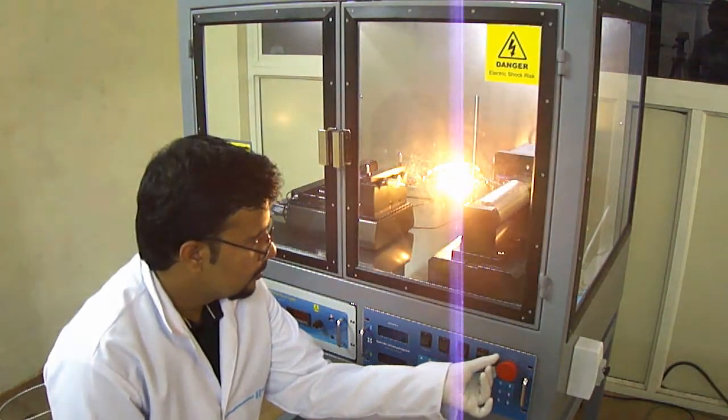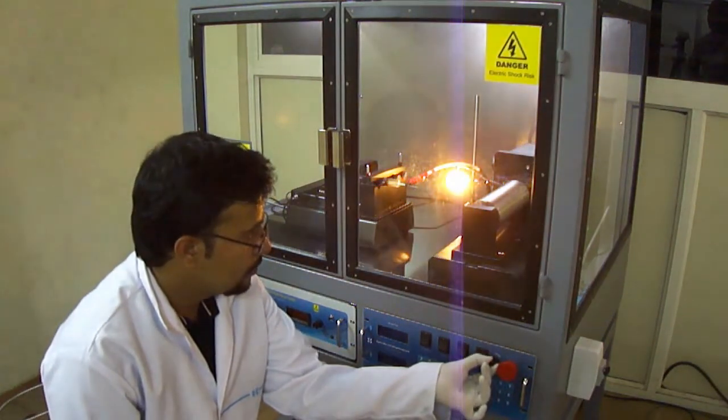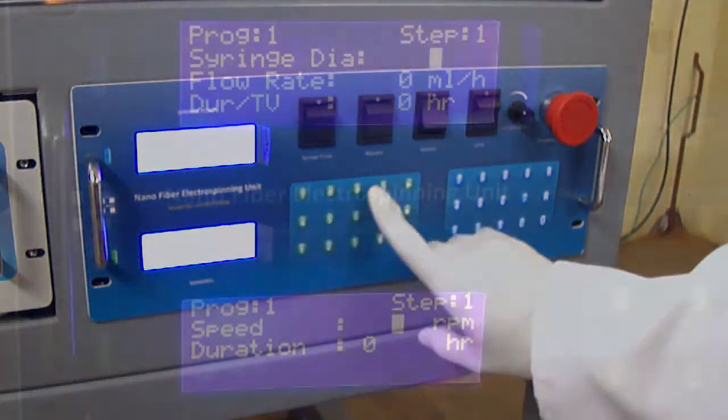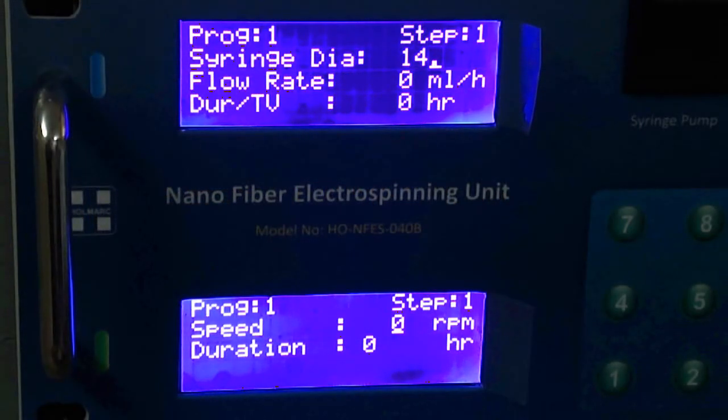Halogen lamp intensity can be controlled from the controller module as per requirement. This model uses a microprocessor-based control unit that interfaces the operations of the syringe pump and mandrel. The control unit has separate keyboards and displays for mandrel and syringe pump.